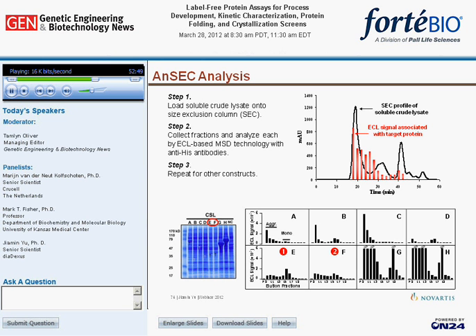The ECL signals for each fraction are graphed in red in the top example figure and black in the bottom figure. As you can see, constructs A, B, G, and H all contain mostly aggregated soluble target protein. The ratio of monomeric to aggregate protein improved significantly in constructs D, E, and F. But there really wasn't that much protein in D. As I mentioned earlier, constructs E and F were the winning constructs at the end of our 10-month-long project. Next slide.